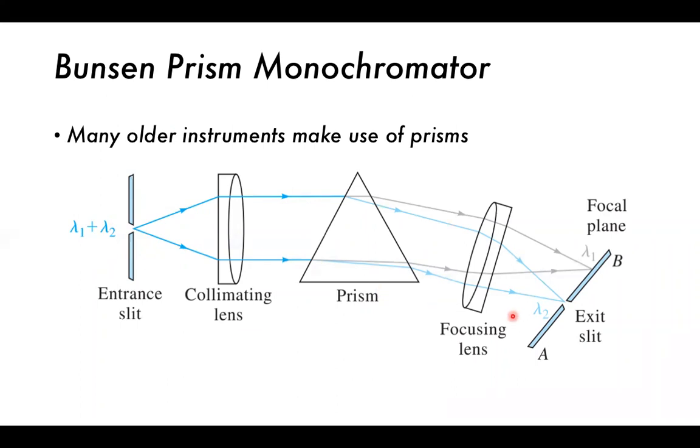It'd be in some sort of box, but anyway, the general flow is this: the 2 wavelengths of light come in through the entrance slit, and then they're dispersed because of the size of this. Think of the double slit experiment. Then that is dispersed onto a collimating lens, which parallelizes the beam of light, makes it more coherent. Then this is focused onto a prism where the light passes through at different rates because of refraction, which we learned about in the previous session.